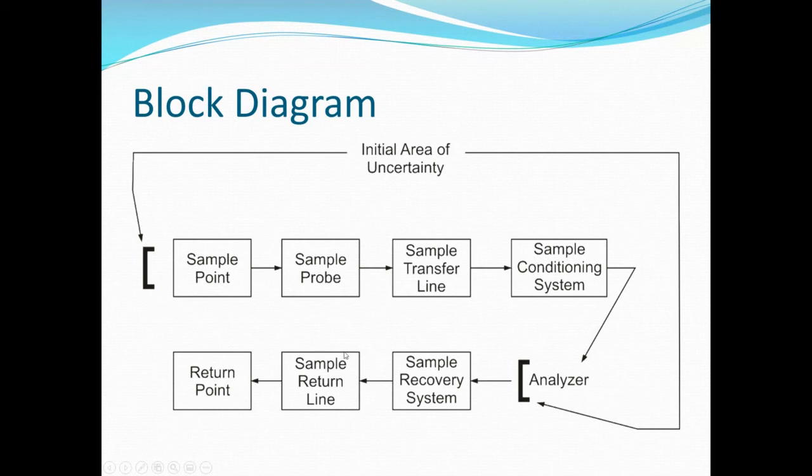So by having this all in here, it gives you an easy way to select where you're going to start. Here's a good way to start. I looked at the block diagram. I'm thinking, well, the analyzer's got power on it and there's numbers on it, so I'm not going to start there. So let's go to the next possible thing.